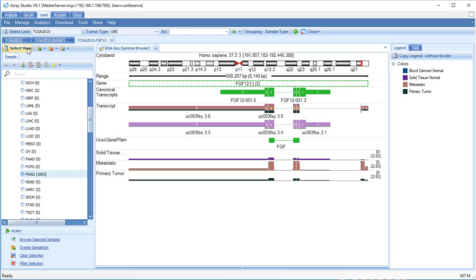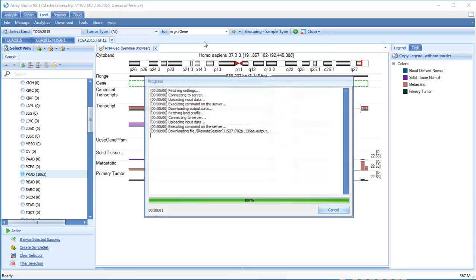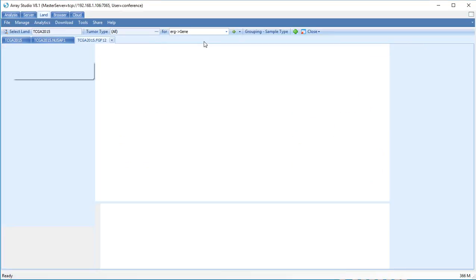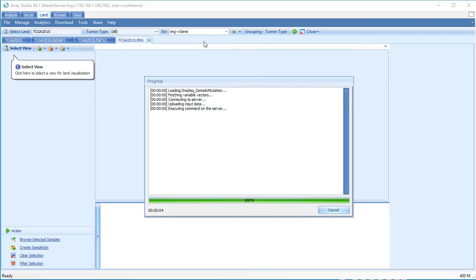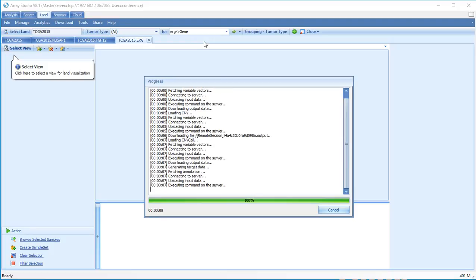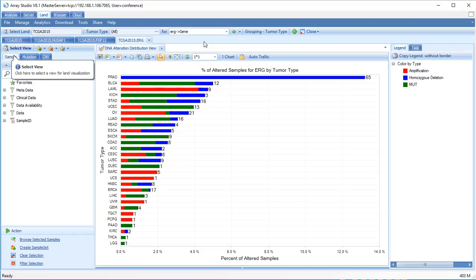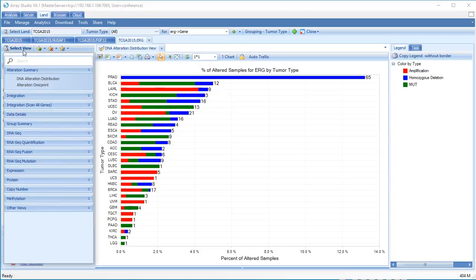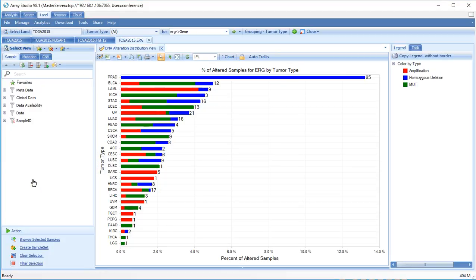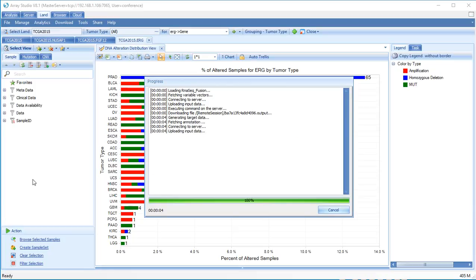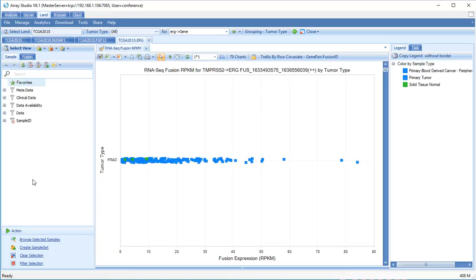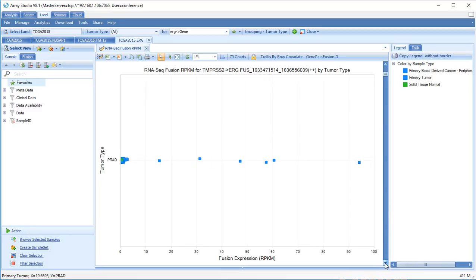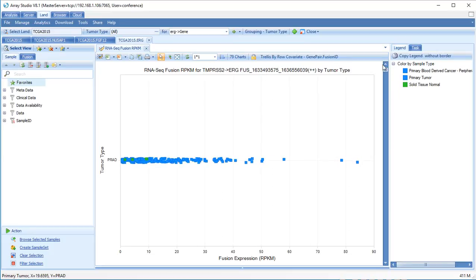Gene fusion events can be detected from RNA-seq data. Let's look at the gene ERG. Select the fusion RPKM view. This shows a separate chart for each identified ERG fusion, measuring expression levels of these fusion genes. The types of fusion events that are displayed can be filtered under the Fusion Filter tab.